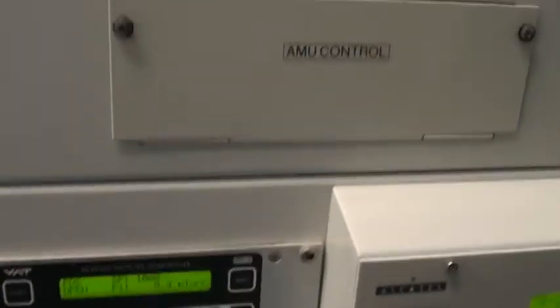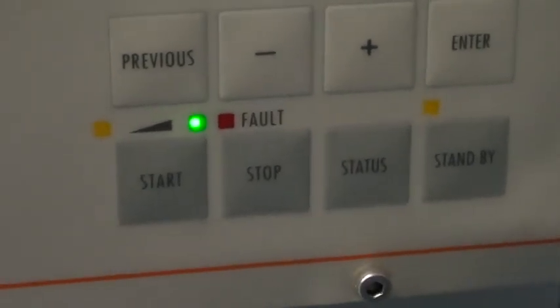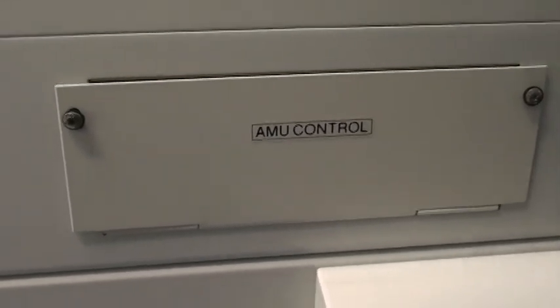The system has inside this enclosure behind the chamber the Maglev Turbo, the Alcatel ATH-1300M Turbo. The Alcatel ATH-1300M Turbo controller. The system has a VAT valve controller and a VAT valve APC, automatic pressure control, controlled by the computer system.